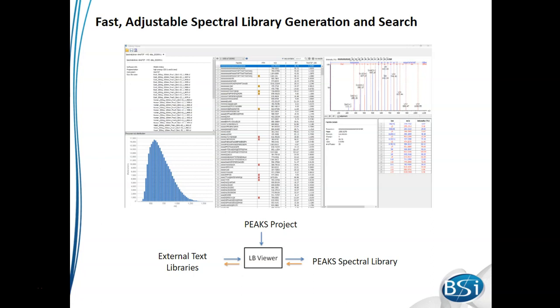In PeaksX Pro, we've made massive improvements to our Spectral Library search. One of the ways that we've done this is make an adjustable text format Spectrum Library. For example, here you can see that you can bring in a Spectral Library from any source that's compatible with our library system, and then bring it up here in a Viewer.